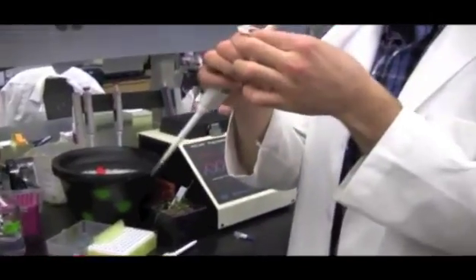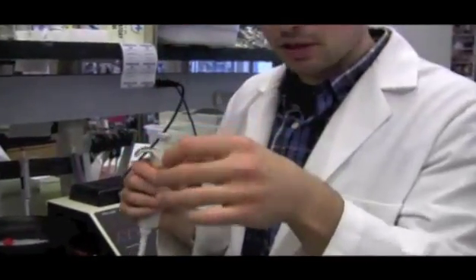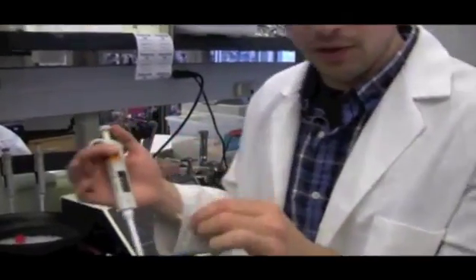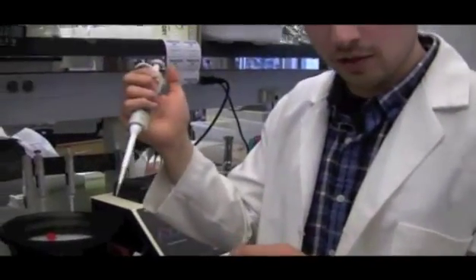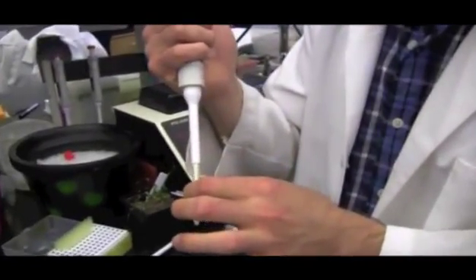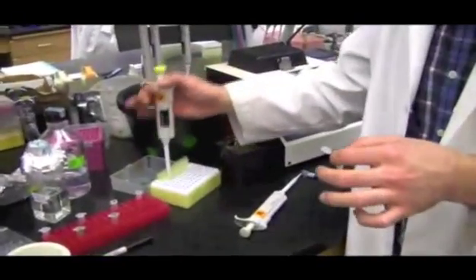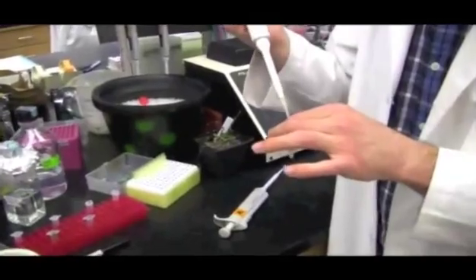And in here is a whole bunch of bacteria. I can't tell you exactly how many because they're so teeny tiny and small, but there's quite a bit. So I'm going to mix our DNA that we just manipulated with the bacteria and mix it up a bit. Cool. Alright, so now we're going to take this bacteria and we need to put it into something that we could use to shock it.